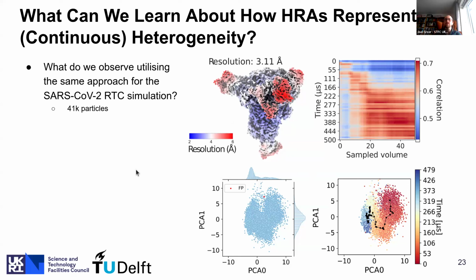Once again, the latent space is quite difficult. So once again, we train CryoDragon using these picked particle images on this data set. If we then look at the two-dimensional latent space embedding, this is just a priori still quite difficult to interpret.